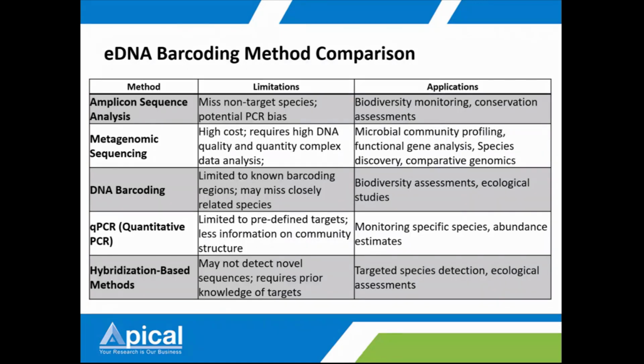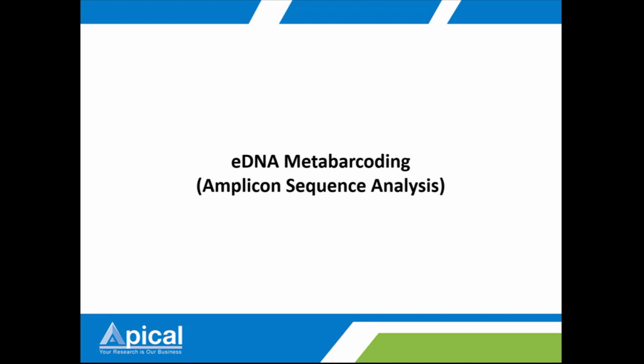Right. Okay, so this is a comparison of eDNA barcoding methods. But for today's webinar, I just want to focus on one method, which is the amplicon sequence analysis approach. This is something that we have well established, and we would like to share our experience of running eDNA metabarcoding using an amplicon sequence analysis approach.